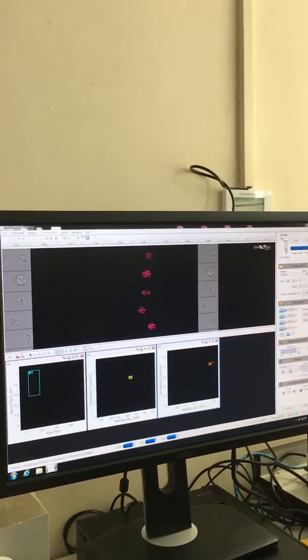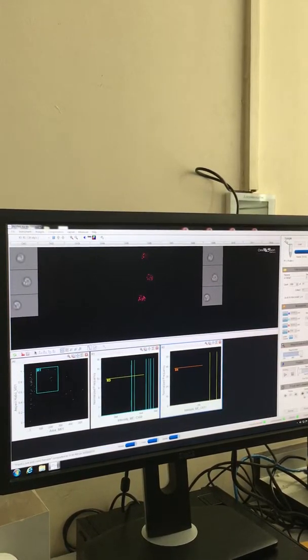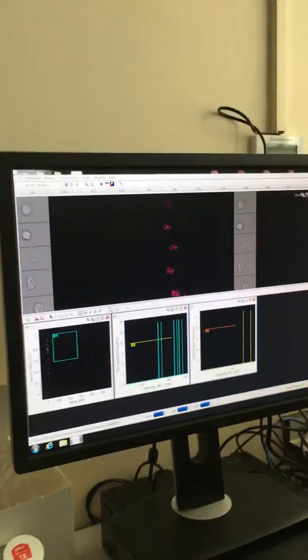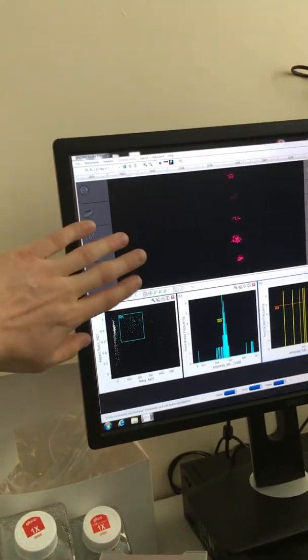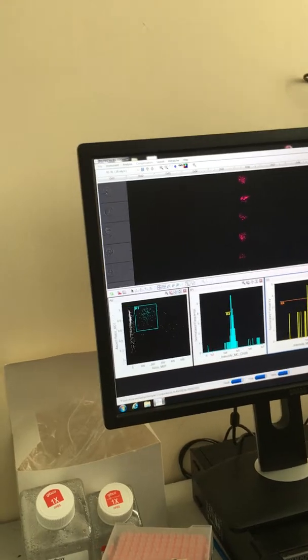Okay, so now you hit recenter. I leave it there for now, just to see what it looks like. So now you can see what it's doing. It's setting up the camera. So see, it's all blurry. All the images are really blurry and they're not focused. So now you'll see it comes into focus, because that's the camera and the machine going.